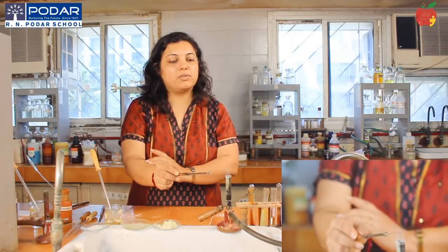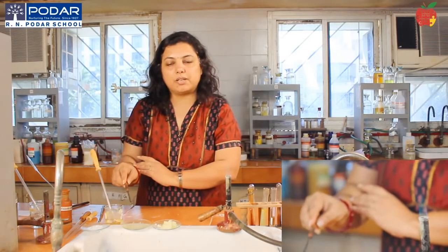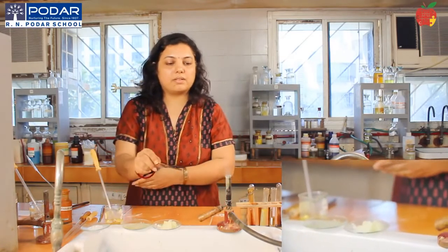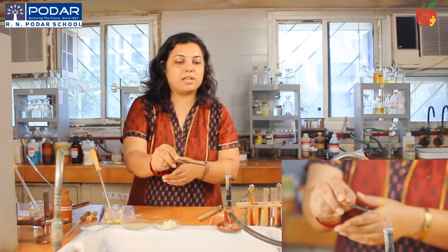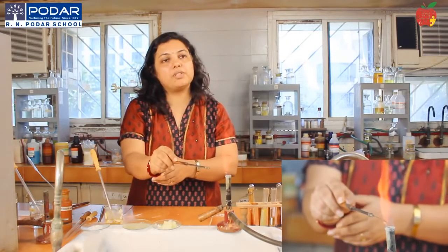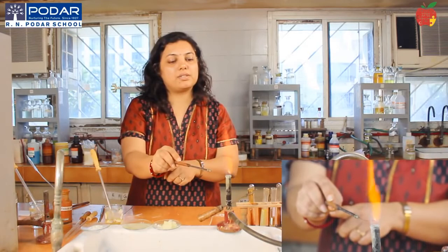Okay, now you see that the whole of strontium has been on. Ideally I should wash it and treat it with acid, but just to show you again, I'll dip this in your calcium salt. Now can you see some streaks of colors coming out? So that is for your calcium. A color is imparted to the flame. Now you can see the beautiful color which has been imparted to the flame, by which you can detect your calcium, which is your brick red. This is your brick red color. Fine. So brick red coloration to the flame will indicate calcium.